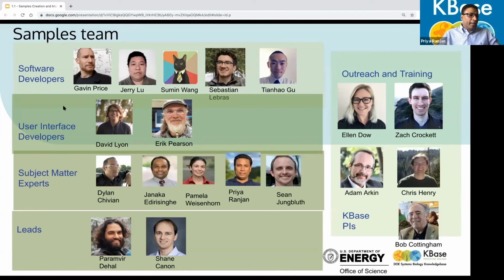So the ideal way would be to work with KBase when the time is right, to find the mappings that already exist in KBase to your mappings. And we have some thoughts on how to make that possible. It's just that it's part of a later version of our sample effort, and not samples 1.0. So maybe samples 2.0 would have those features.